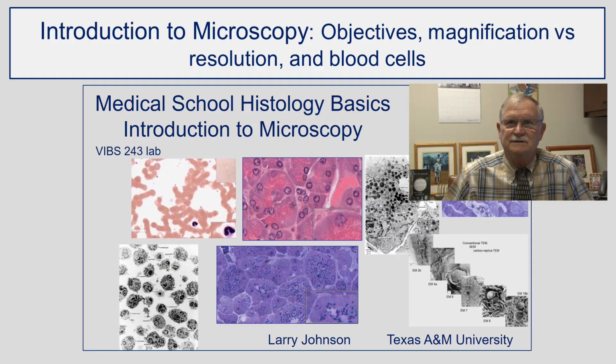Hi, I'm Larry Johnson. I'm a professor at Texas A&M University, and today we're going to talk about microscopy, an introduction to microscopy. We're going to talk about the objectives of the overall talk on microscopy, talk about magnification, resolution, and we'll be covering some blood cells as we look at using the different types of microscopy.